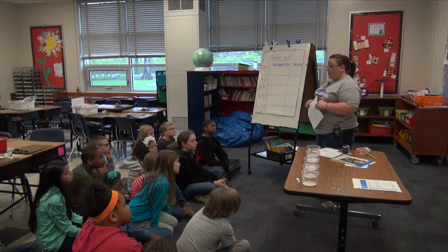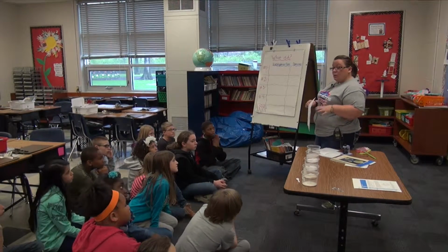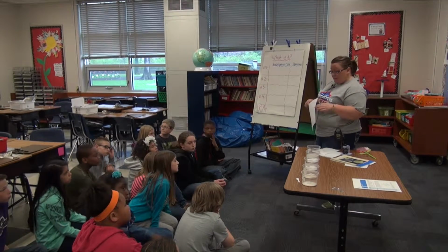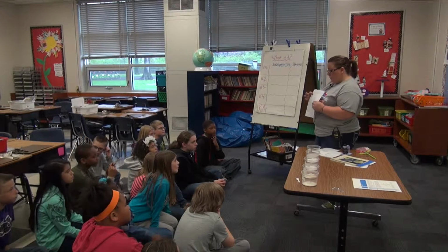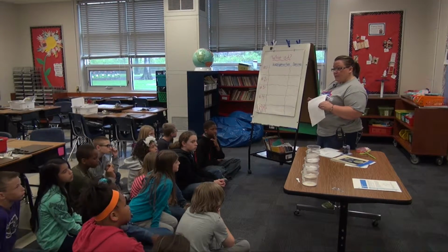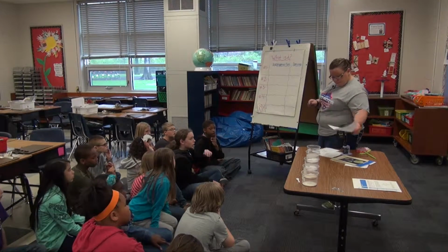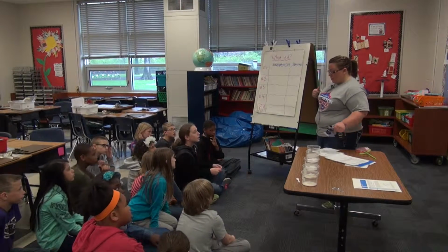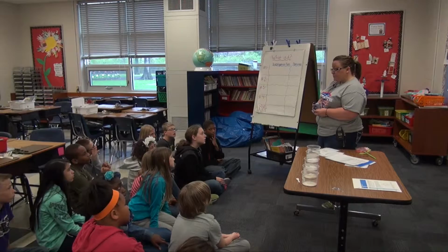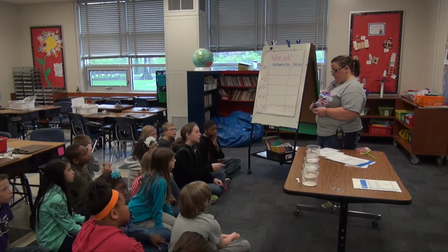Okay. I'm going to send you back to your lab groups. Make sure that you work as a team and look at the 4 different shapes or specimens. You are going to need to predict before you use your microscope. Who can tell me what we need to do if we cannot get our microscope to focus correctly? We need to turn the bottom of it, our light reflector, and make sure we turn it to the outside.